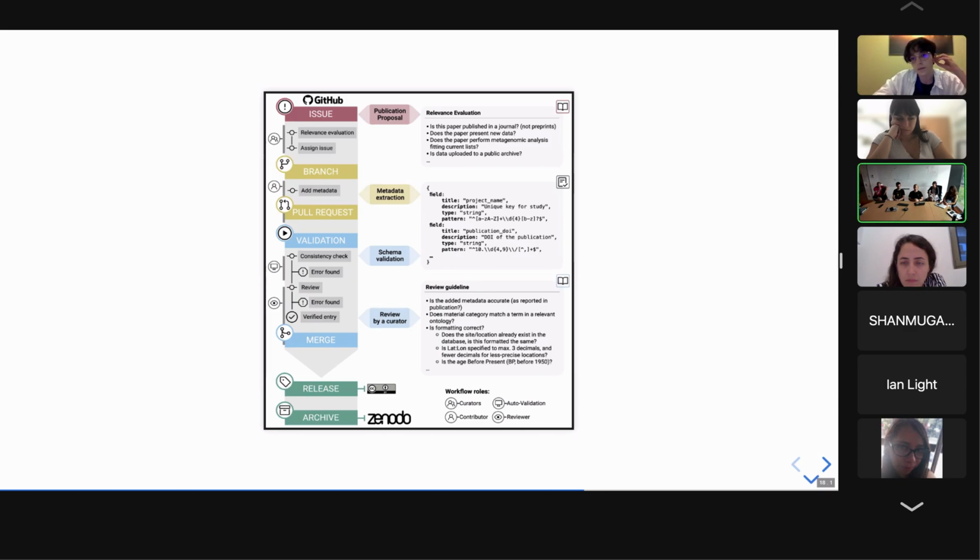So for each table we have guidelines of exactly what should go in there. And for that one, I specified one way that I knew from when I used to be in the lab a very long time ago. So it's nanograms per microliter, I think. No, copies per microliter. Do you remember? In Pandora, it's copies per microliter. Copies per microliter, thank you very much. But in Pandora, it's copies in total. So it's copies in 50. I think, exactly, but I normalize it down to the microliter.